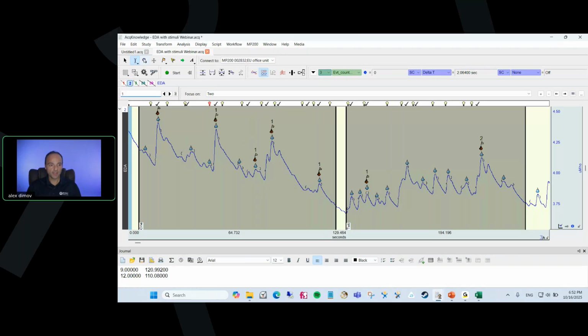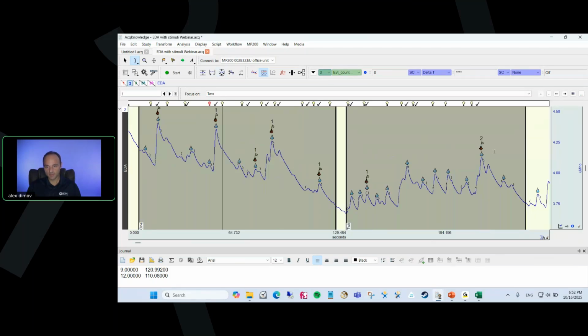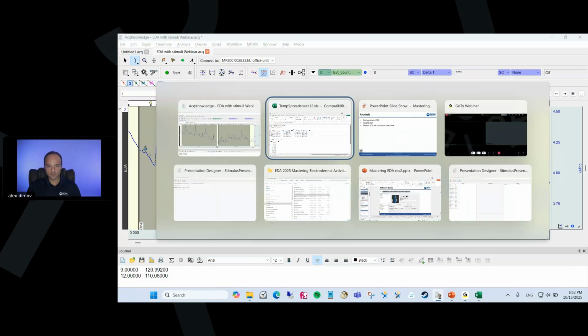Okay, well, right after that, we zoom in here. So the stimulus presented here, and then within the 1 to 4 second window, we have the onset and then the response. So these are now marked as different kinds of responses. These are called specific, and the blue ones are now non-specific skin conductance responses.